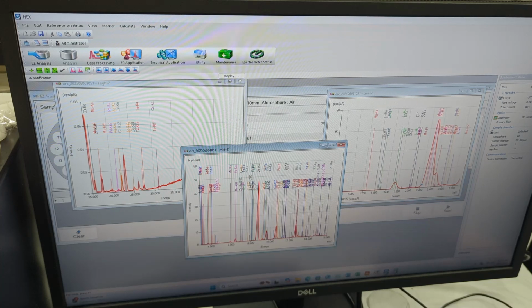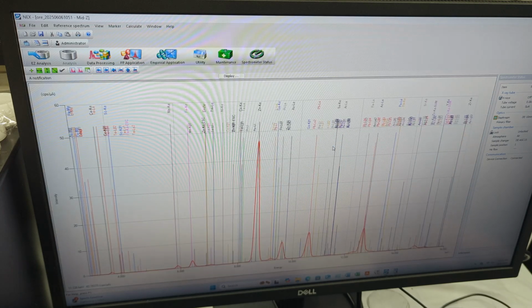So we want to find our LA line. So here we see the gold LA lines, and if I'm correct, I see iridium, gold here. There should be also a platinum one somewhere here. But anyways, let's open this up and see. So where is it? There you go, platinum and AU gold. So this right here is where it's calculating the gold and platinum at.